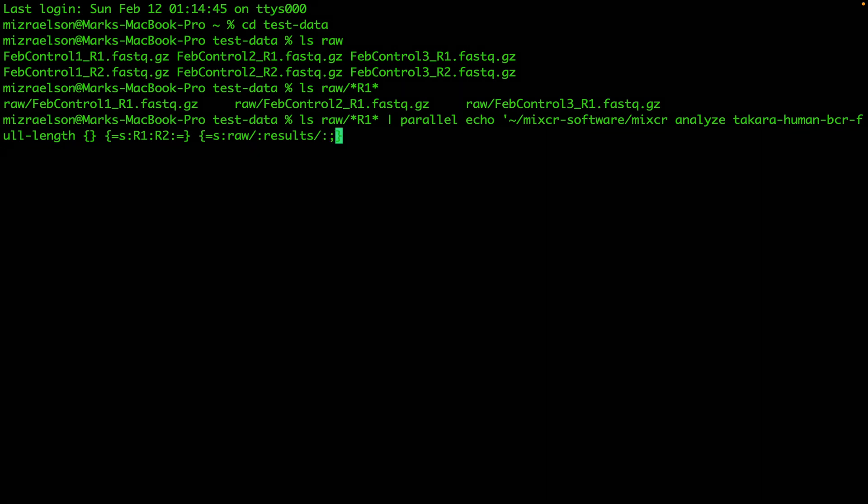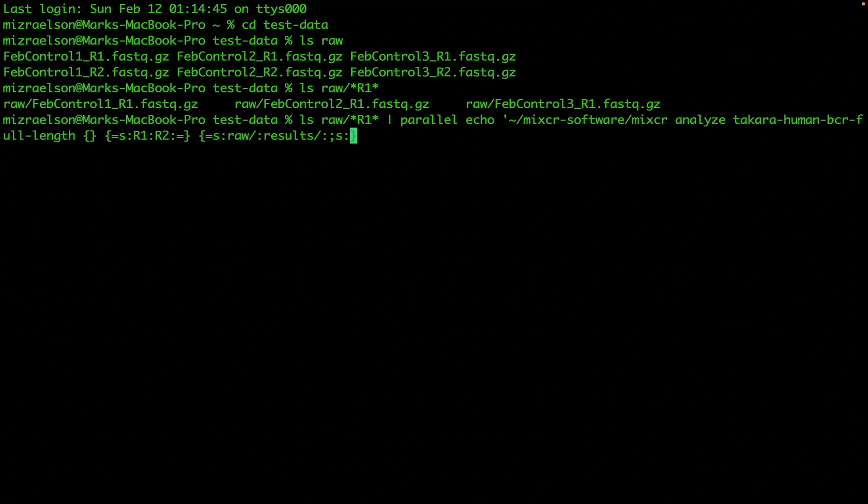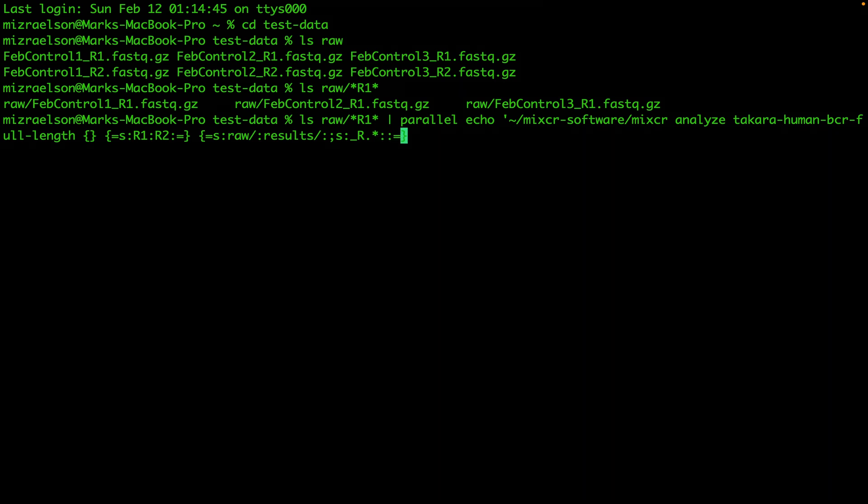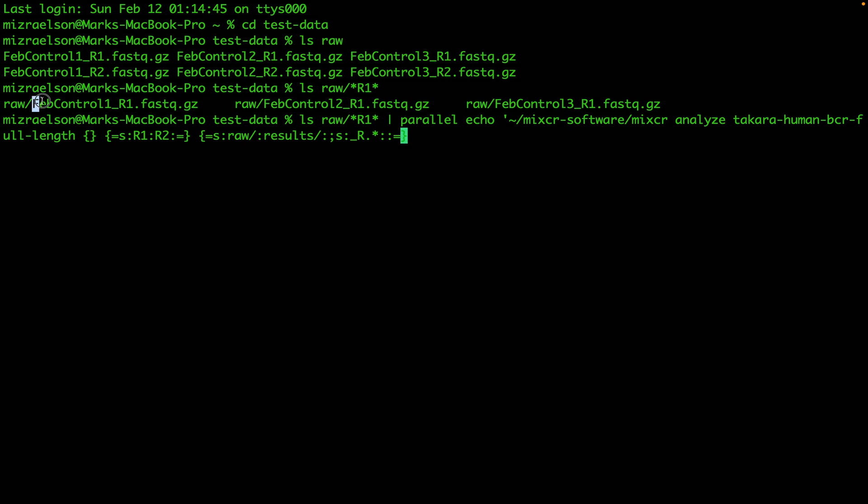And also to create the prefix, we're going to trim everything after underline R. So we'll have only that part of the file name as a prefix.